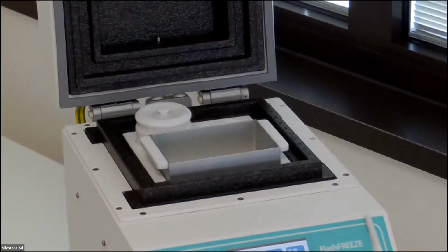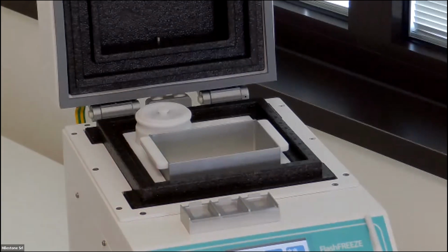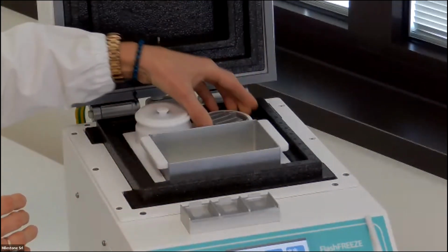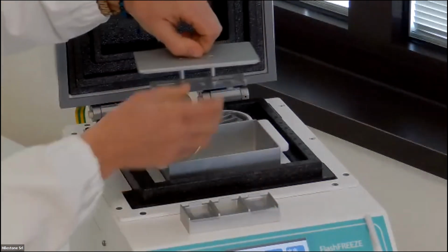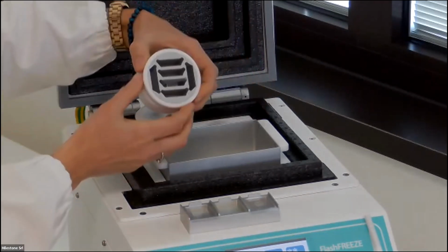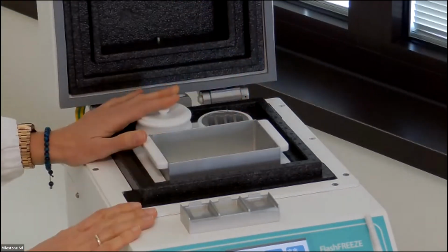But also we have this tool that can be helpful to prepare samples at room temperature before the freezing, and also this other tool that allows you to store some samples after the freezing. So imagine that these cryovials are frozen, at this point, we can keep them in this container. I show you better. Just to preserve them for a short time at -80 in the flash freeze.